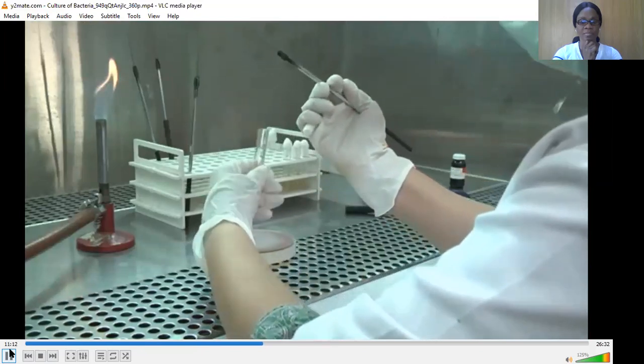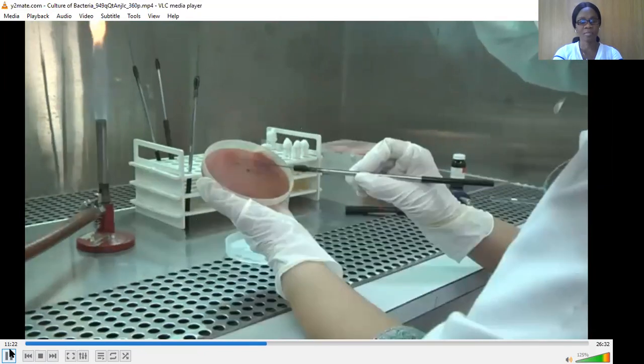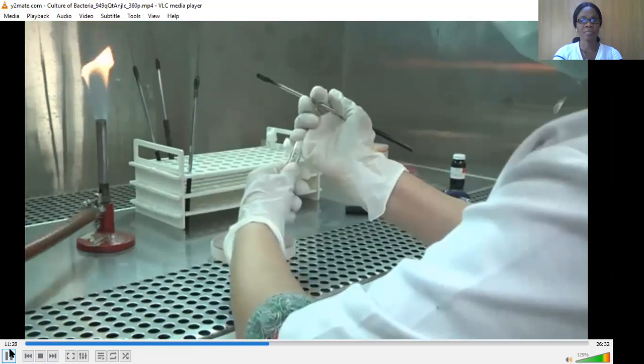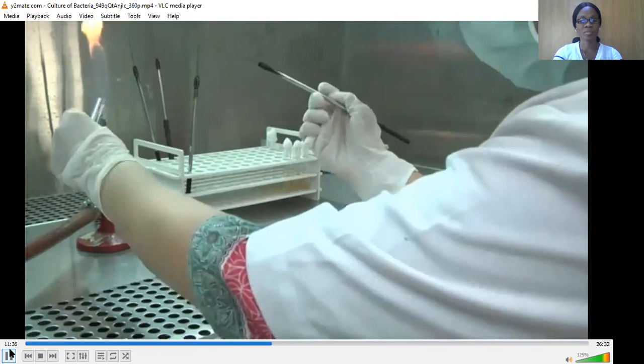Remove the cap or cotton wool plug of the bottle or test tube with the broth culture with the little finger of your right hand and flame the neck. Load the inoculum onto a sterilized wire loop. Hold the agar slant medium in your left hand and remove the cotton plug or cap of the agar slant medium with the little finger of your hand and flame the neck.